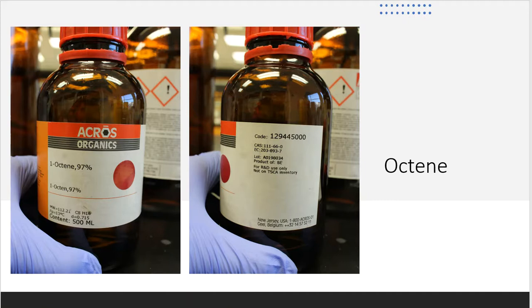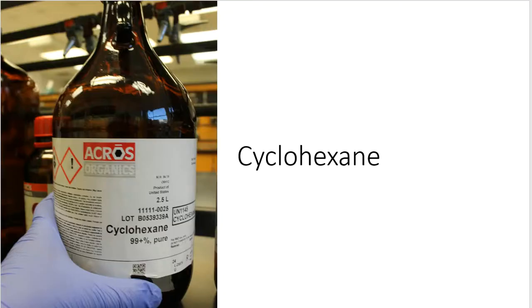Octene, you should be able to draw without Googling it, right? Octene, draw it. So 1-octene is Acros Organics, and this lot number is A0198034 if you need it. The next one is cyclohexane. You should be able to draw that one too without Googling. That's the beauty of learning nomenclature in organic. Save yourself some time. Use your noggin. So cyclohexane also comes from Acros Organics, and the lot number's here, big and bold, B0539339A.